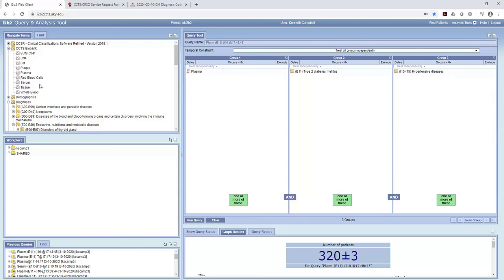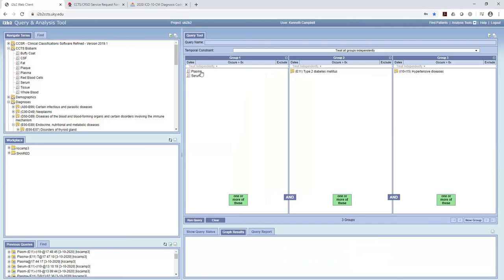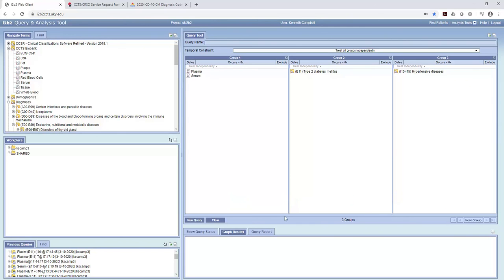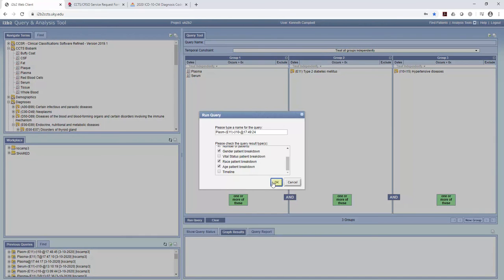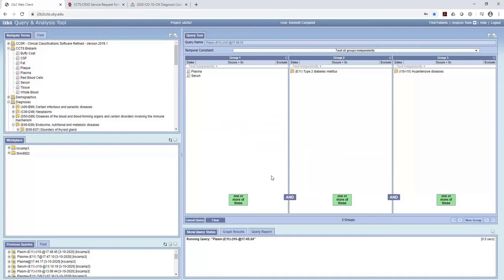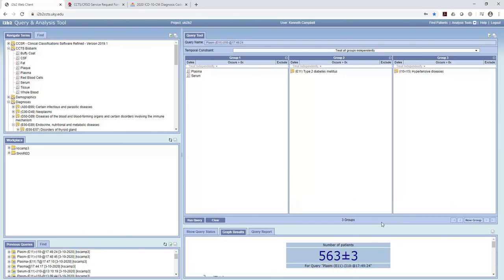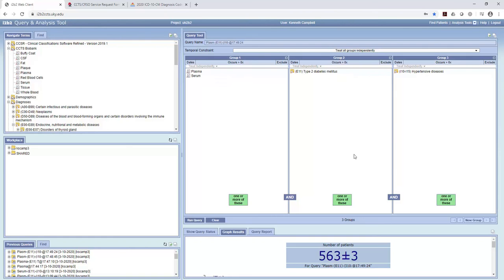And then let's just add in serum. And now what we're searching for is plasma and or serum. So it'll search for both of these who have those two medical conditions. Run that query. And so we captured an additional number of patients because we're now searching for plasma or serum, diabetes, and hypertensive disease.